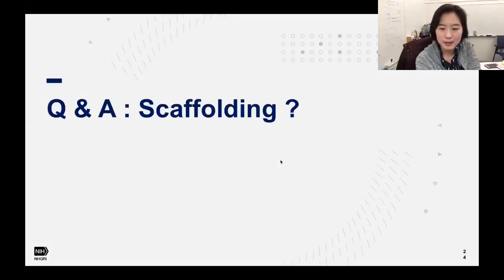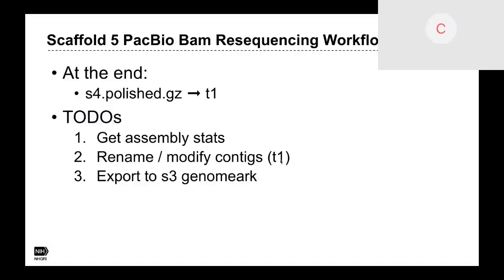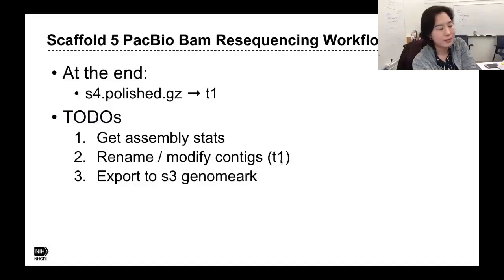And I think that's all for the workflow. Does anyone have a question so far? So we want to put the FreeBayes one on hold right now, right? Right. So I'm checking the FreeBayes. I checked the FreeBayes QV that I ran on the Hummingbird, and I saw that the QV was almost not changed. I see. Yeah, good. I think it's good to investigate first.